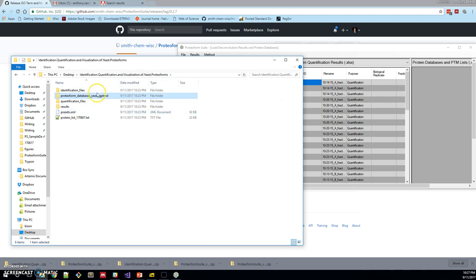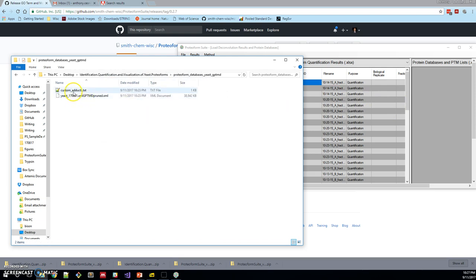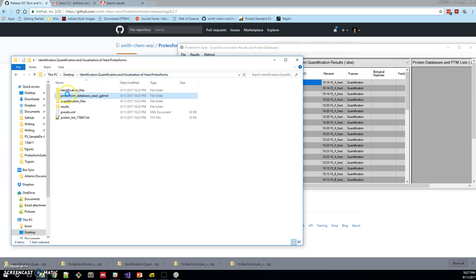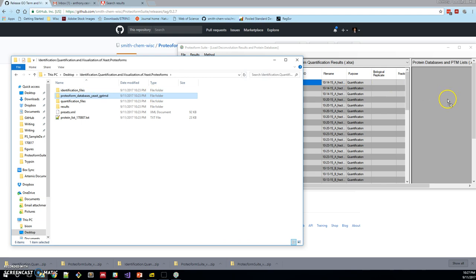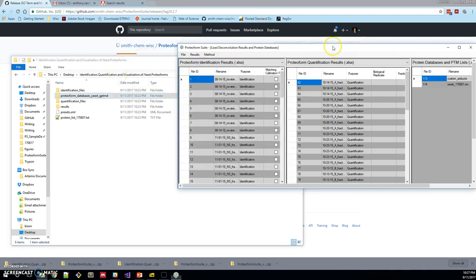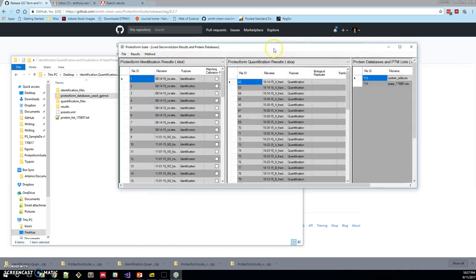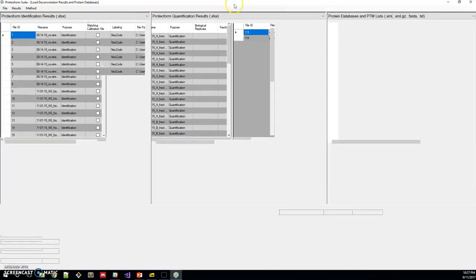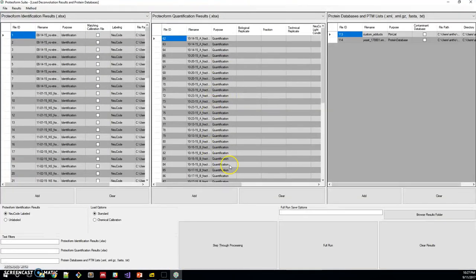Let's drop these databases in. There's also a custom modification list for adducts that we'd like to include. We'd like to identify those adducts and the proteoforms they're adducted to. So we drop that in.